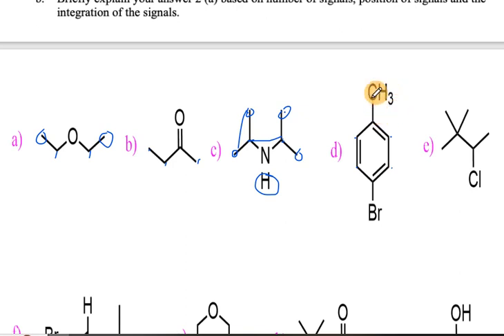Then for the carbon-13, you can have of course 1 here, 2 here, this and this will be 3, this and this will be 4, then here will be 5. So we have 5 signals for carbon-13 NMR, but only 1, 2, 3 signals for proton NMR. This carbon has no hydrogen, this one has no hydrogen, so it has no signal for hydrogen.